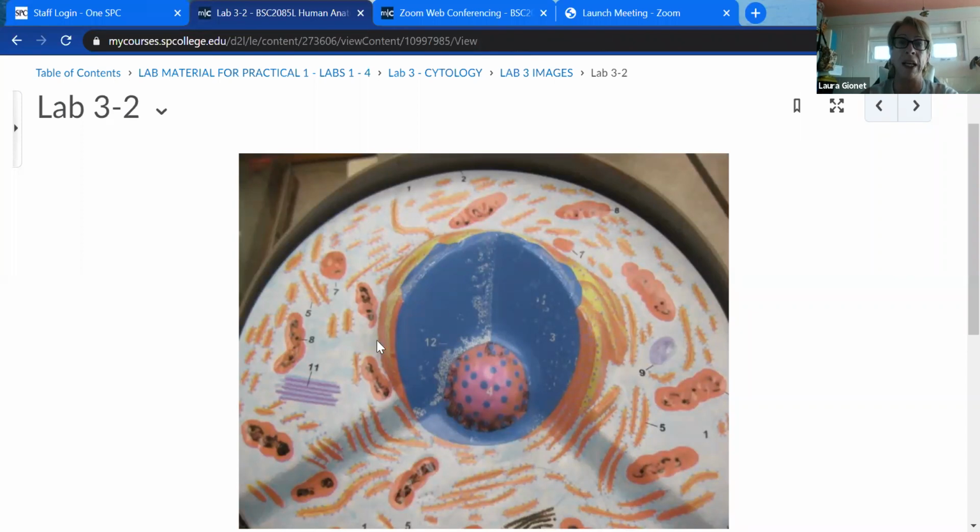Now that we've magnified it, these red jelly beans, number 8, are all mitochondria. The big blue ball is the nucleus. The nuclear membrane is technically the orangey yellow portion that's intimate with it, but we're not going to ask you to identify that. All this material here, as well as on the side and cut open, that looks like caterpillars or little worms, is rough endoplasmic reticulum. The little white dots of material in the nucleus are chromatin.